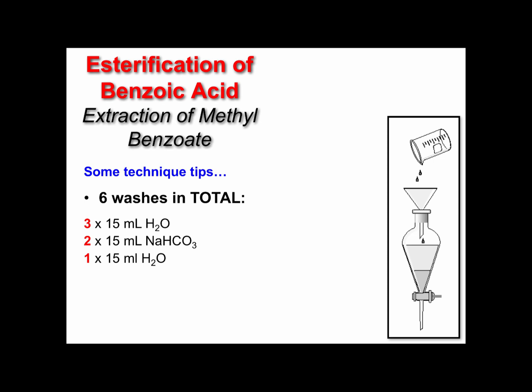So you're going to produce carbon dioxide, i.e. a gas, in your separatory funnel. You need to be venting that gas off so it doesn't build up and something bad happens. After you've done the bicarbonate extractions, you're going to do one final extraction with water to remove any remaining bicarbonate, and then you're going to separate off the organic phase, dry it with magnesium sulfate, and continue along.